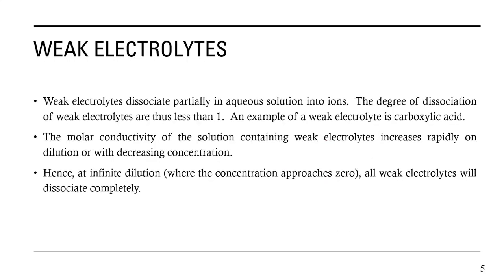On the other hand, weak electrolytes dissociate only partially in aqueous solution, so you can expect a degree of dissociation of less than 1. The example that we are going to use in this experiment is acetic acid. The molar conductivity for these weak electrolytes increases rapidly on dilution, or with decreasing concentration.